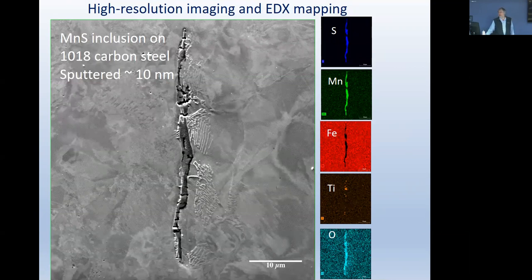So these can all be taken in less than 10 minutes. This is the elemental map, and you can see this was a polished steel surface, carbon steel everywhere. Your knives, your engines, heavy equipment, buildings, they all have iron. We cannot do without carbon steel. And this is how it looks when you polish it and zoom in.